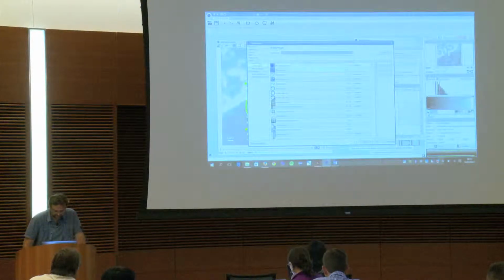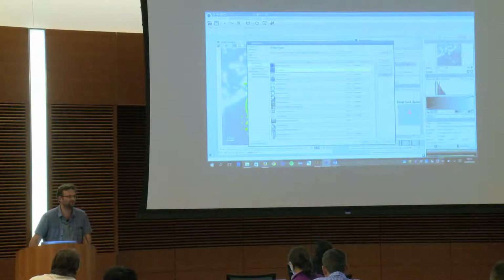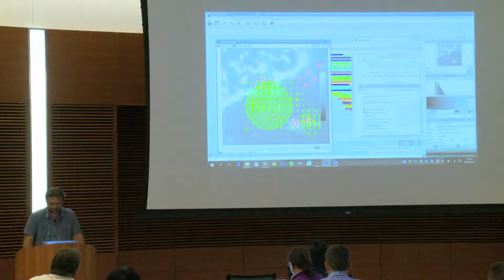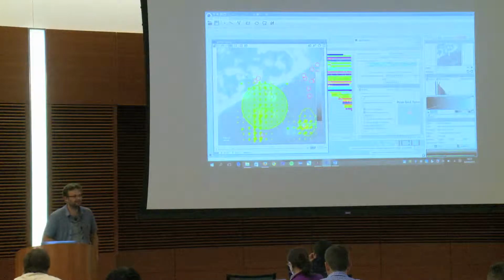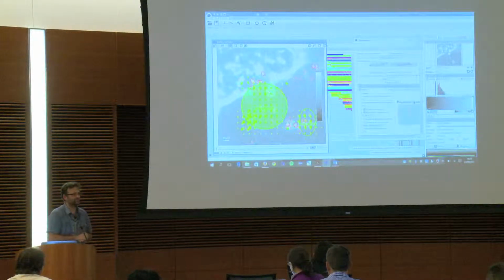People had to go here, for instance, and then click install to have the plugin. It was far too complicated, and nobody was downloading plugins because there were too many steps. Now that we have this thing here, it's much easier to have people downloading the different plugins. Okay, so this was for trackings.